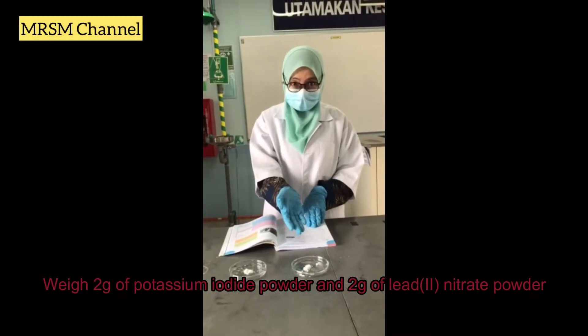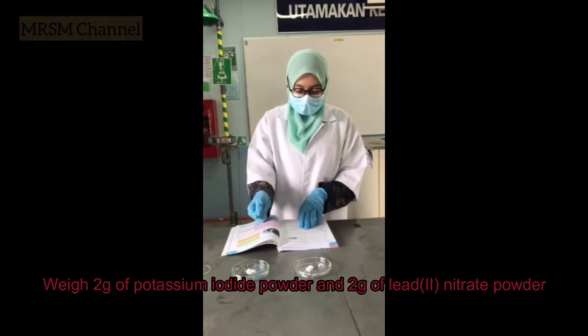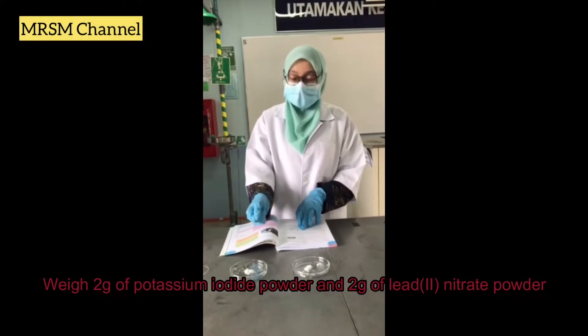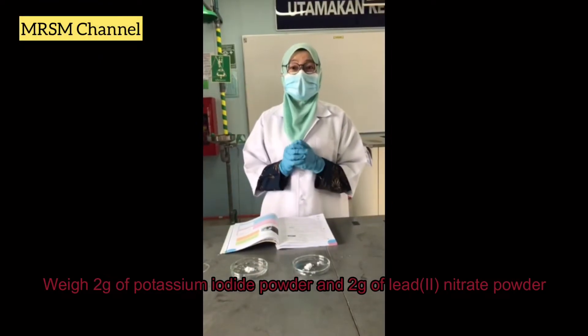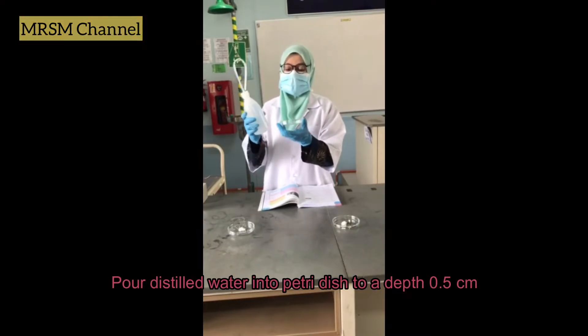We weigh 2 grams of potassium iodide, and then we also weigh the lead nitrate powder, also 2 grams, using the weighing balance. The next step is step number two.